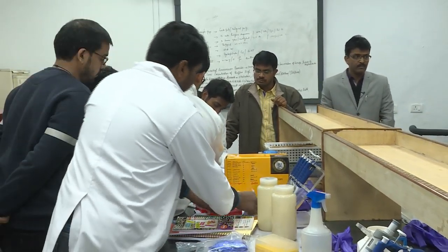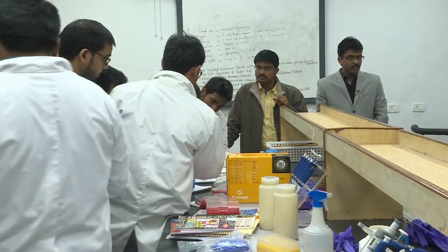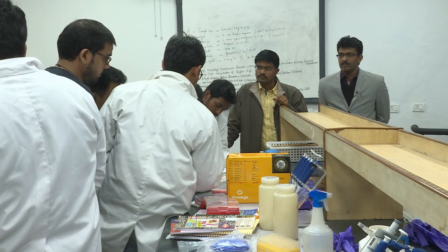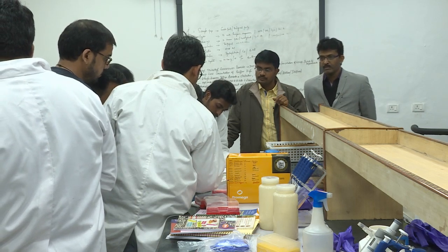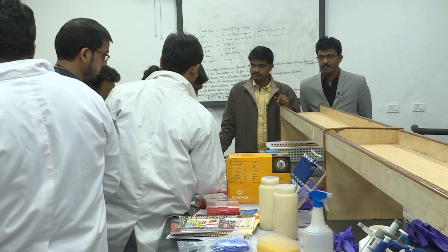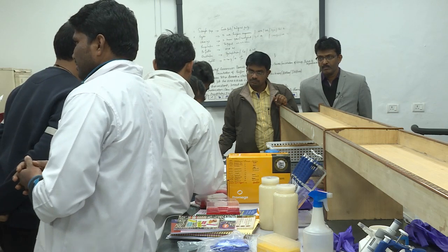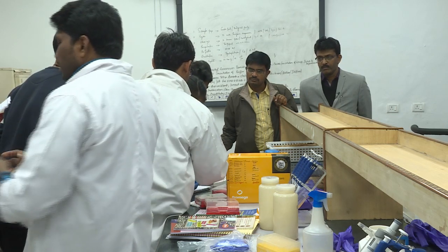Reverse also the same. Then Taq polymerase 5 units, 5 U, capital U. Capital U. Okay, ठीक है. Then DNA. DNA depends. 50 we have. 50 you write. 100 है, 200 है, whatever you take. ठीक है. Then working concentration.